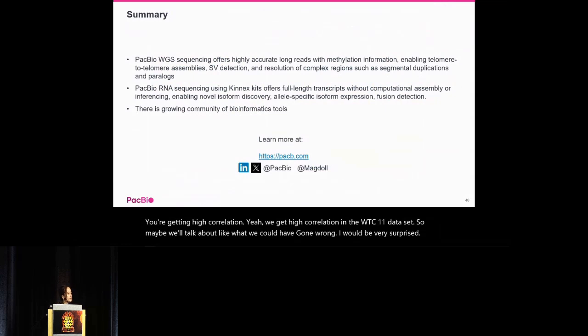Hi, thanks for the interesting talk. I'm wondering if 100% of the long reads are full-length molecules. If not, do you have an estimation of how many are not full-length? That's exactly what Anna's tool SQANTI tries to tell you. Not only that, there's a lot of other orthogonal data you can use. What do you mean by full length? Is it full length to the 5' cap? If we get to that point, then you have to talk about whether you're generating the full-length cDNA.